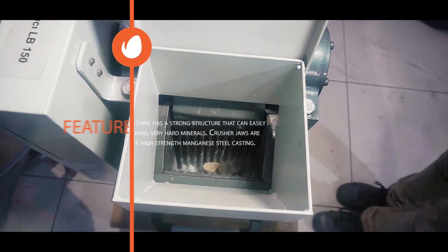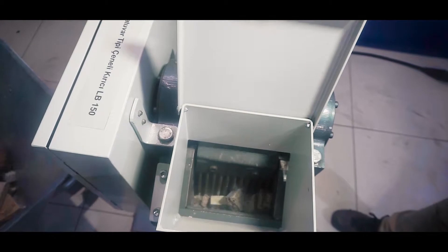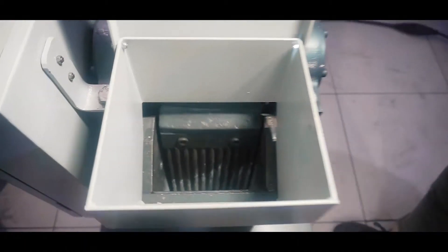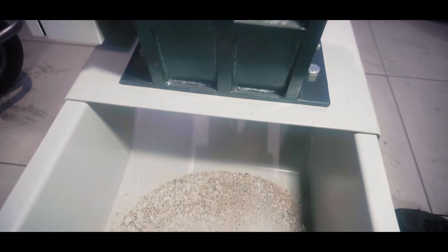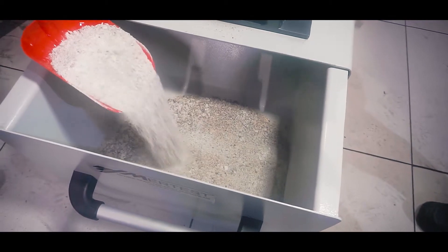The machine has a strong structure that can easily break very hard minerals. Crusher jaws are made of high strength manganese steel casting. Broken items accumulate in the drawer under the machine. As in the example you see, the jaws are brought to the nearest position and the average grain size of the product is 0 to 5 millimeters.